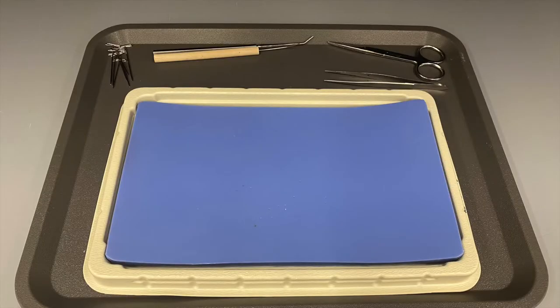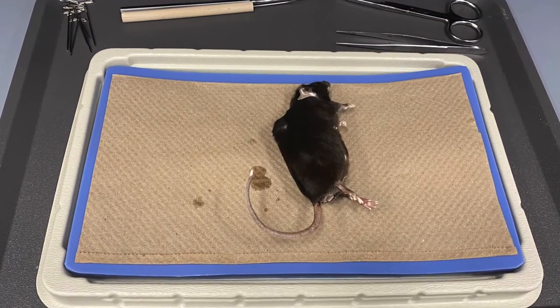The first step is to make sure you have gathered all of the necessary equipment. This includes your dissection dish, a pair of scissors, forceps, a probe, pins, and of course a mouse.